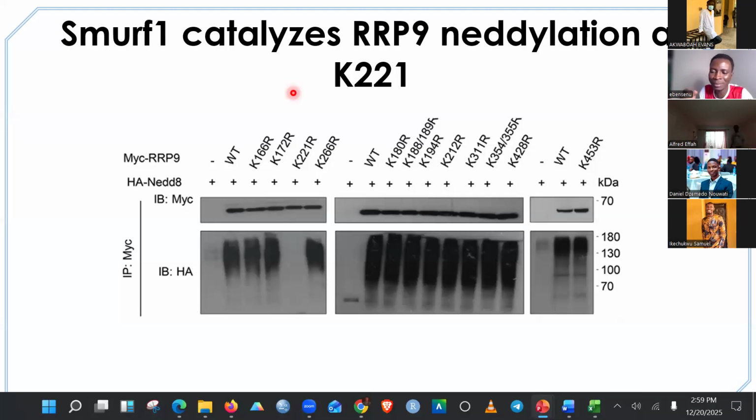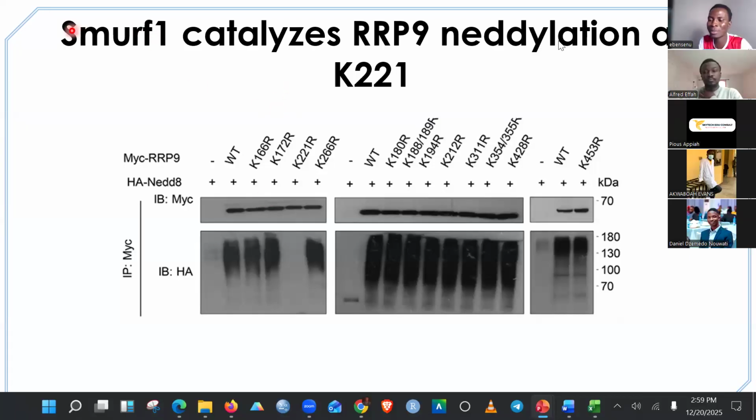In this case, we are using amino acids with the same kind of charge, all positive, so we don't destroy the structure. The function and how they look is a bit altered, but the polarity is maintained in this kind of mutation.